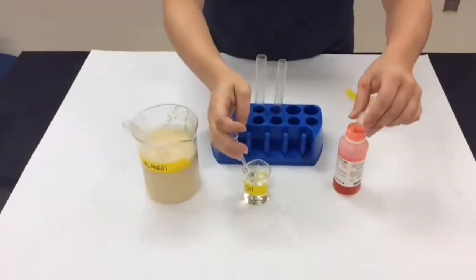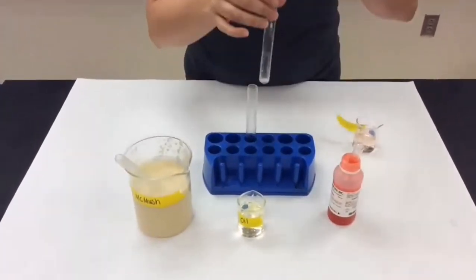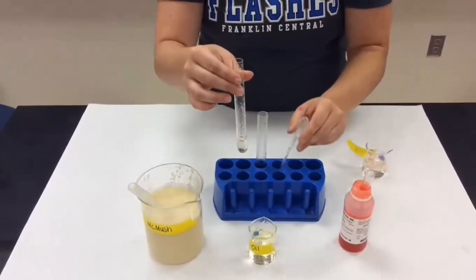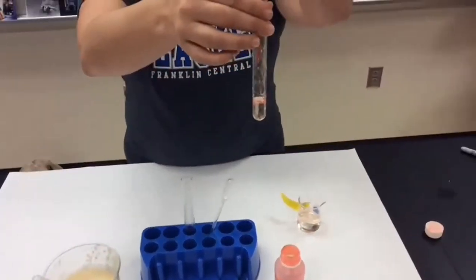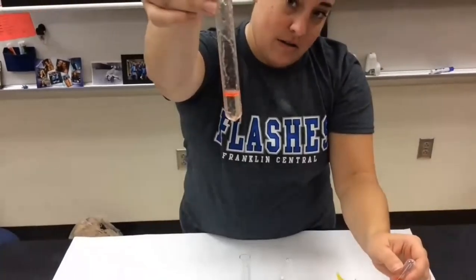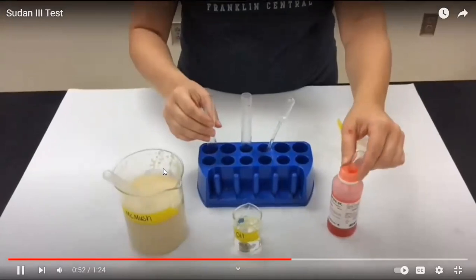But when I go to put this in some oil, I'm going to take a couple pipettes of oil into my test tube. When I put the Sudan 3 into the oil, it stays on top and it will eventually slowly dissolve through. You can kind of see it starting to dissolve in there, but it stays pink. So we're going to see what happens when we do the same.